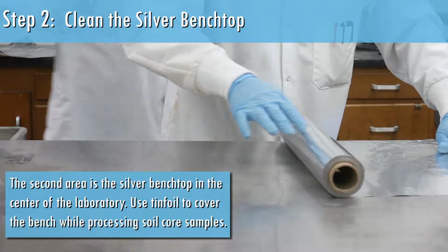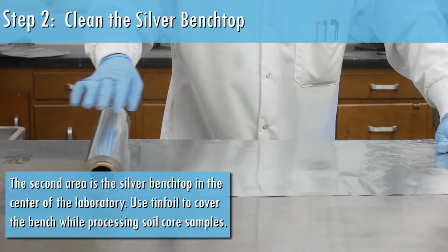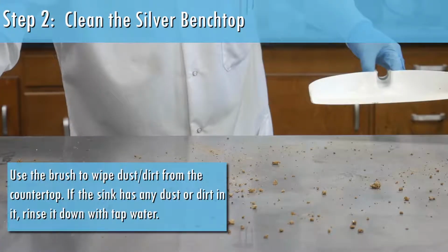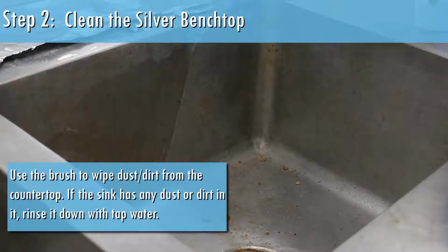The second area is the silver benchtop in the center of the laboratory. Use tinfoil to cover the bench while processing soil core samples. Use the brush to wipe dust/dirt from the countertop. If the sink has any dust or dirt in it, rinse it down with tap water.